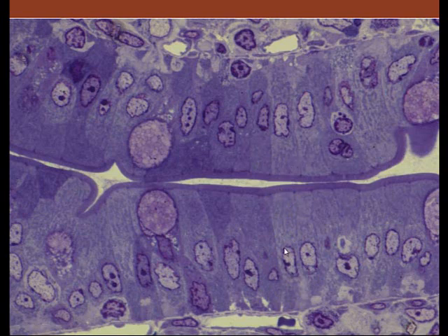Here we see the nucleus. It's got euchromatin and heterochromatin that we see there. You can actually see mitochondria too, very nice mitochondria that we can see there in the cytoplasm.